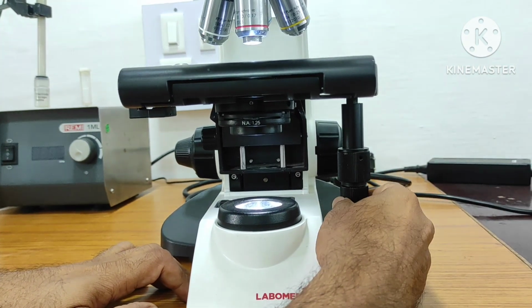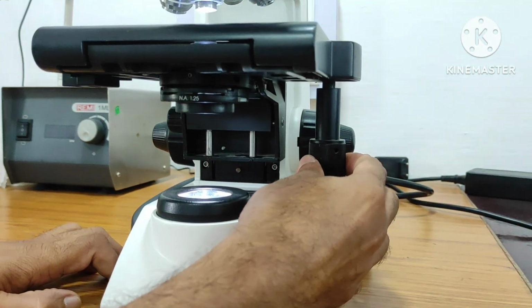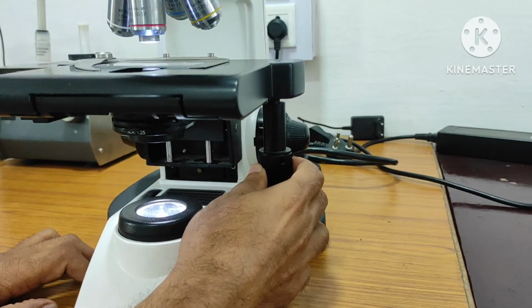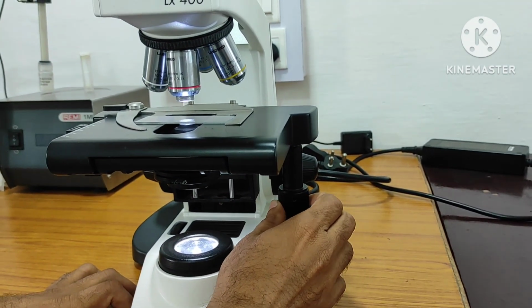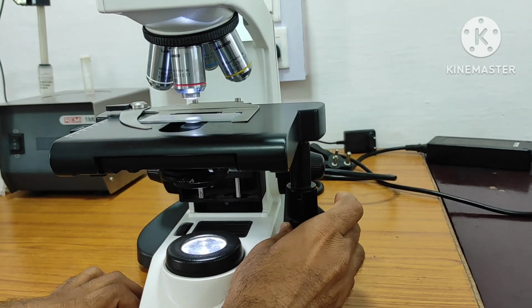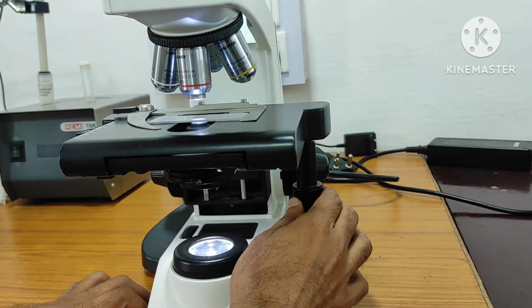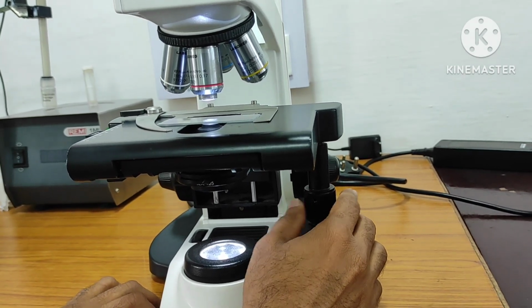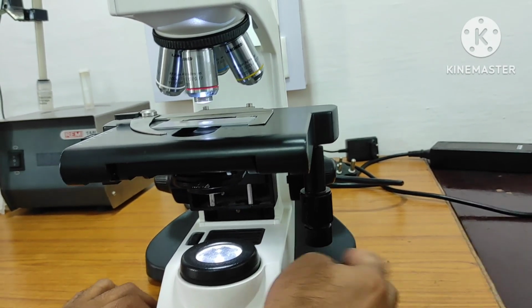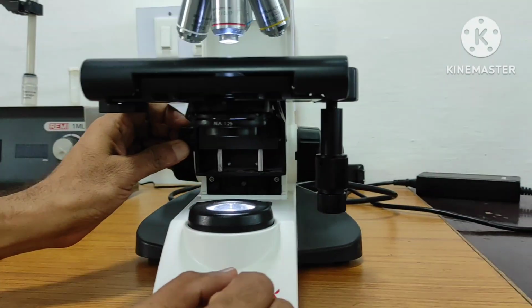And these are the two knobs present here, right? One knob is for the movement of the slide. The entire stage is used to move with the slide, so we can move the slide and stage to and fro, left and right, and in the opposite direction also. Once we fix the slide in the clamps, there is no need to touch the slide again, right? By using these knobs we can move it to and fro in any direction.